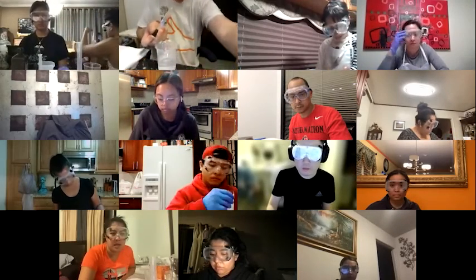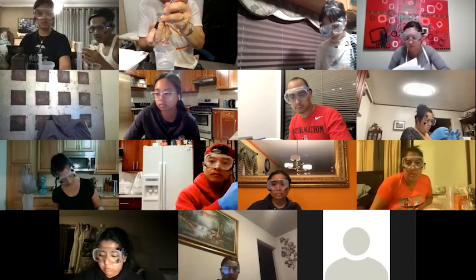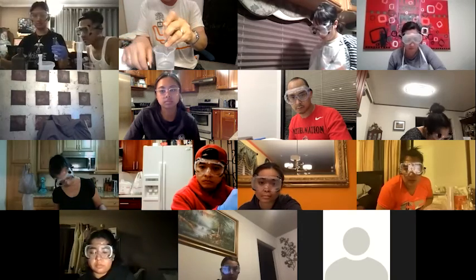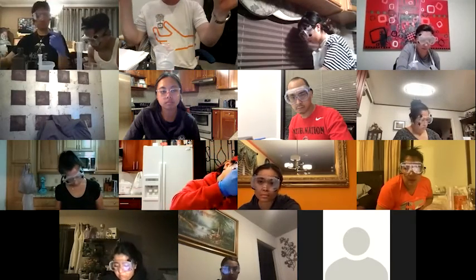Can you put your camera downward a little bit so we can see how you're uncorking it? I've got my finger over the bottom, and then I'm just going to let the water out. Now we may get a whole bunch of nothing here. Oh, it works. Did you hear that? Yeah, it works. It worked better than when it was full.